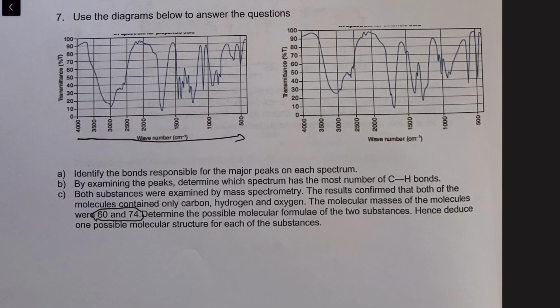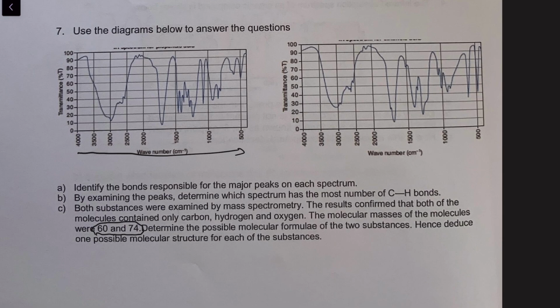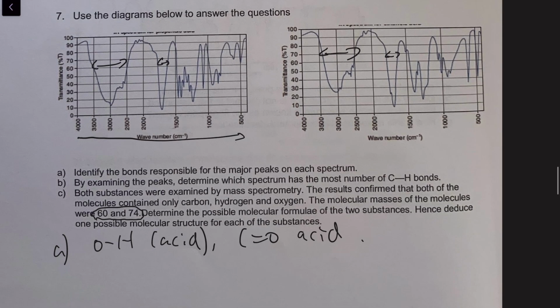So this is also something you need to get familiar with. For the major peaks, I think we have done enough practice. You can immediately see it's the O-H for acid and the C=O double bond also for acid. So you know that both compounds are carboxylic acids.